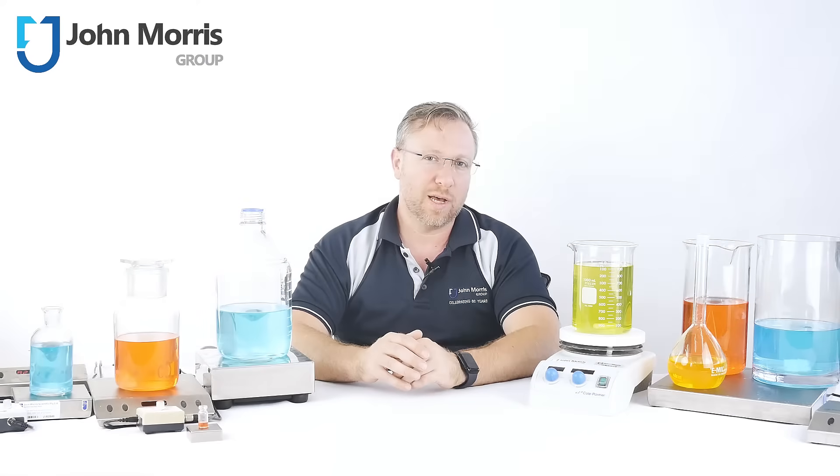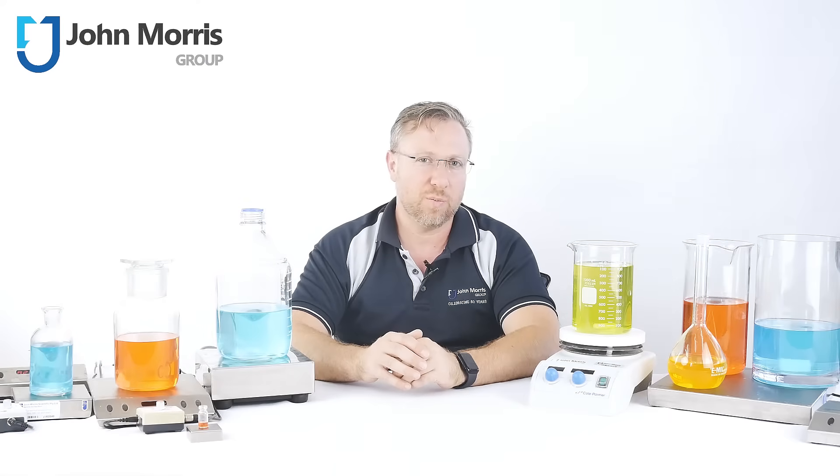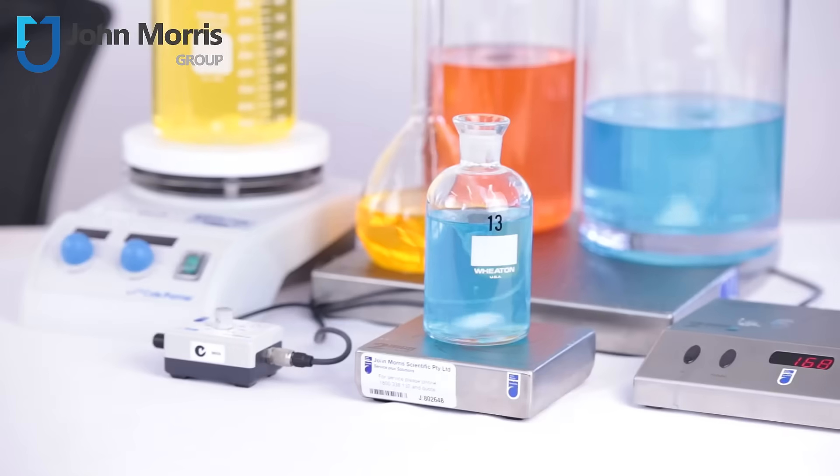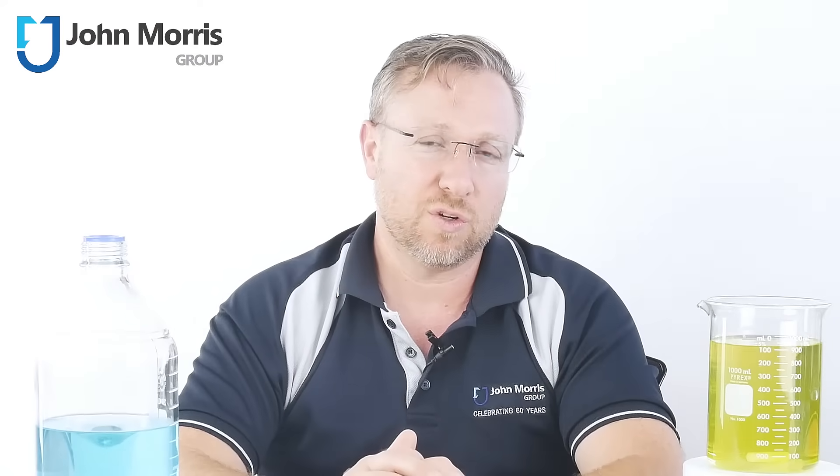Magnetic stirrers are used to obtain or maintain a homogeneous liquid mixture, often for growth of media or for keeping buffer solutions in suspension. Now, there are various brands and versions of magnetic stirrers in the market.